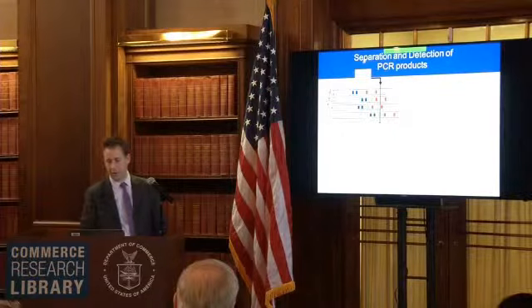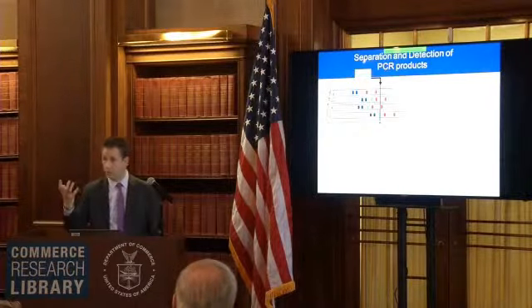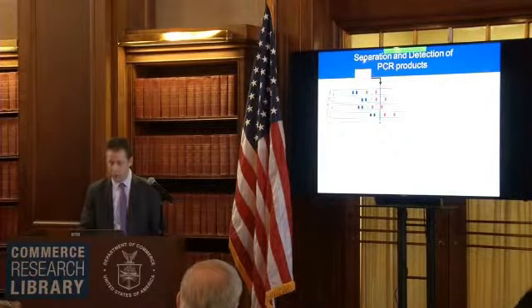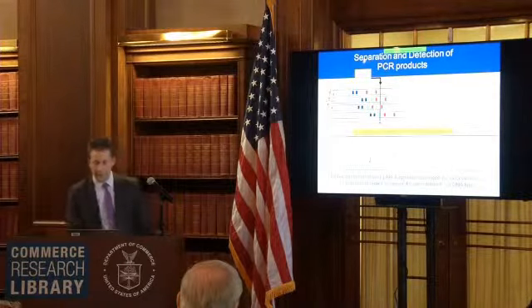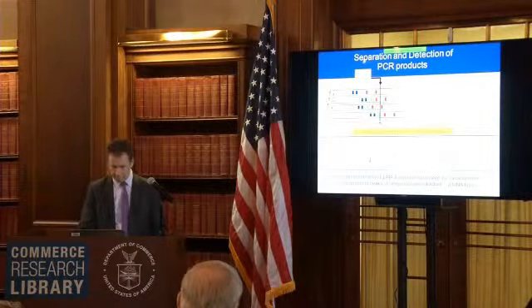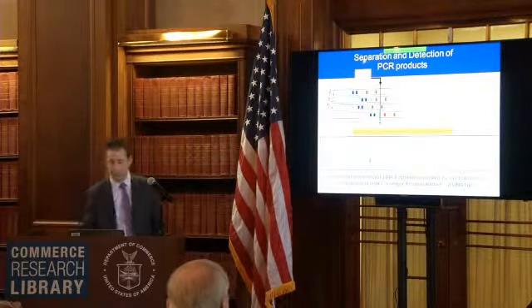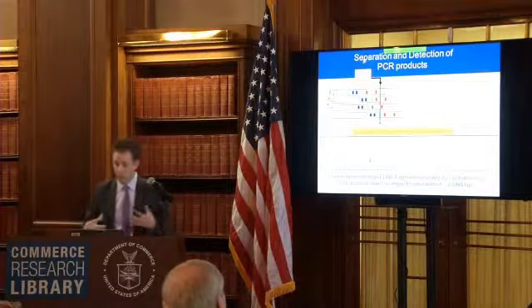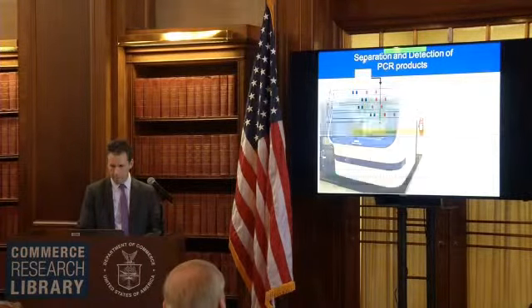So this is just another way of looking at this, a cross view of 4 capillaries, and these different fragments with the different alleles or different repeat lengths go through the tubes and are detected by the laser. This takes about an hour or so. So in the end, you'd end up with your profile. And really, these peaks that are now labeled with the alleles on the bottom here represent your DNA profile that would be unique for an individual.